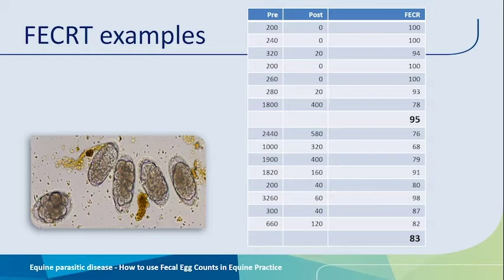And so the more horses we can sample, the more biological replicates we get, and the more reliable the results. The recommendation from the American Association of Equine Practitioners is to have at least 6 egg count positive horses in a fecal egg count reduction test. We are fully aware that there are lots of instances, examples, where there just aren't that many egg count positive horses present on the farm. And of course, you could still go ahead and run the fecal egg count reduction tests. You just have to exercise more caution in interpreting the results.